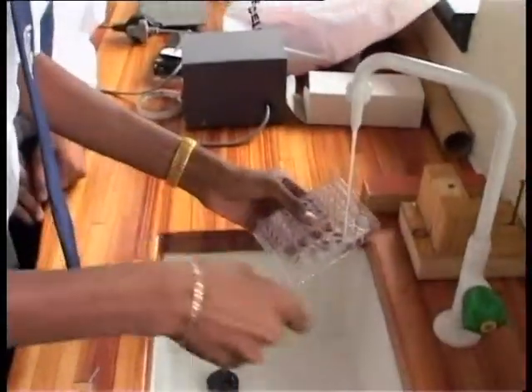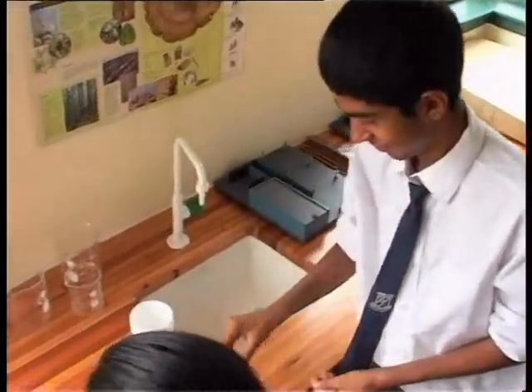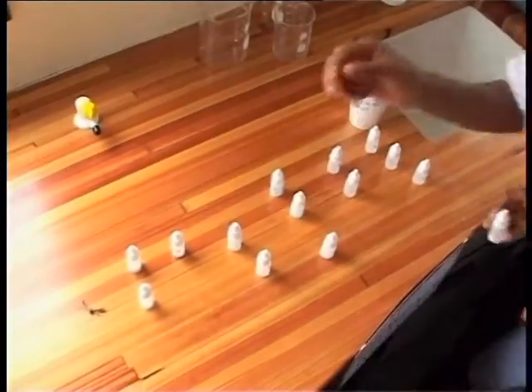It is important that equipment is cleaned after practical work. Teachers say they don't want to do practical work because they've got to clean up all this stuff afterwards. Well, of course, that is quite wrong. Teachers must train their learners to clear up afterwards, and the monitors return the stuff to its correct place in the correct cupboard.